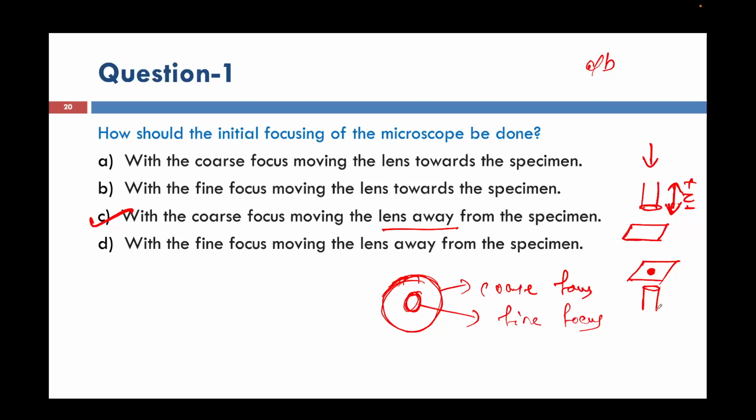Okay, so you are saying this question is for the normal microscope? Not normal, the reflectance one, the vertical microscope. Vertical reflectance microscope is different. Yes, only for the vertical microscope this is applicable. Okay, I'll check with the inverted one. Here you can write vertical microscope. I'm not sure about the inverted microscope, but I'll check and come back to you.